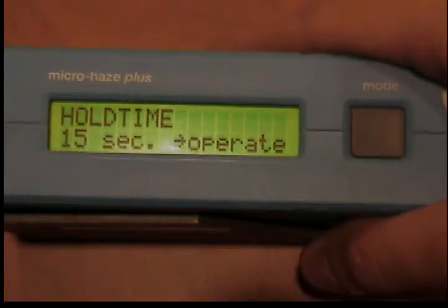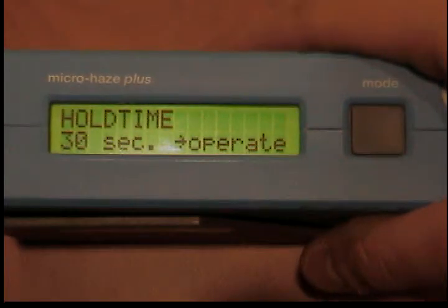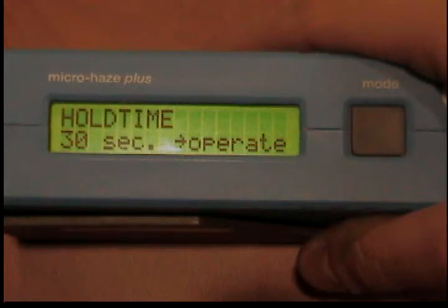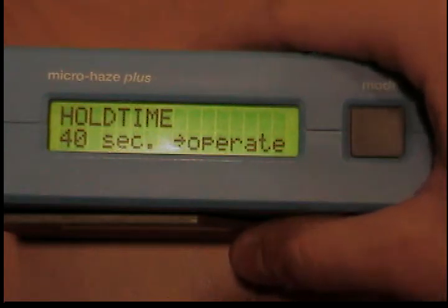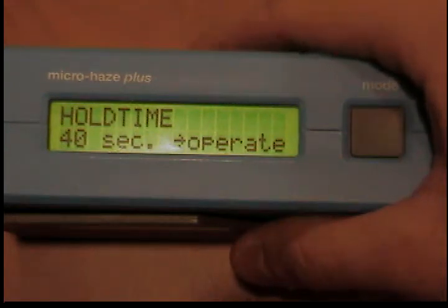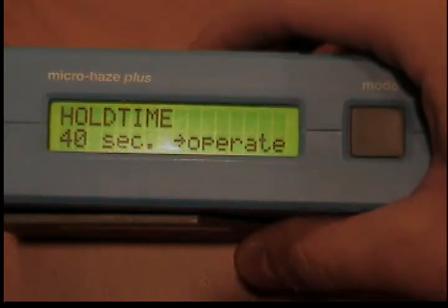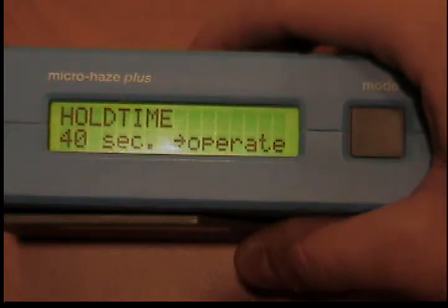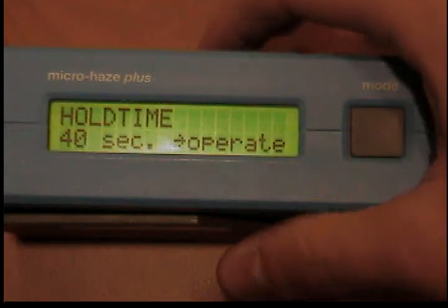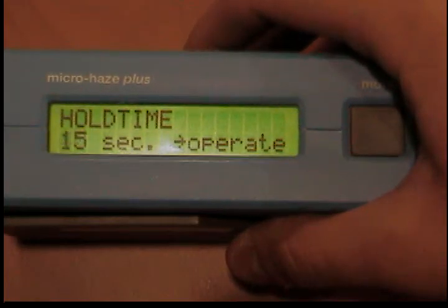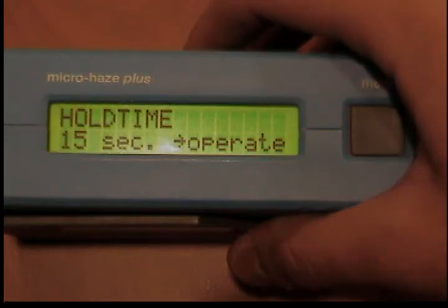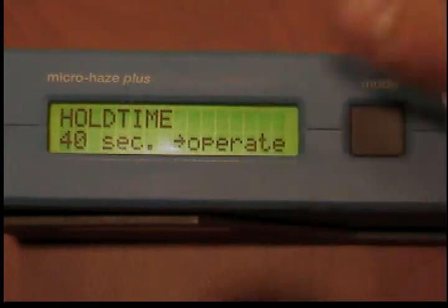If applicable, measured values recorded in statistics are retained. To change the hold time, insert the unit into the protective holder and switch the unit on with the mode button. By pressing the mode button several times, skip over the calibration and measurement routines until the display hold time appears. Press the operate button repeatedly until the desired hold time is displayed. Confirm by pressing the mode button and skip over the routines until the measurement modes all appear.